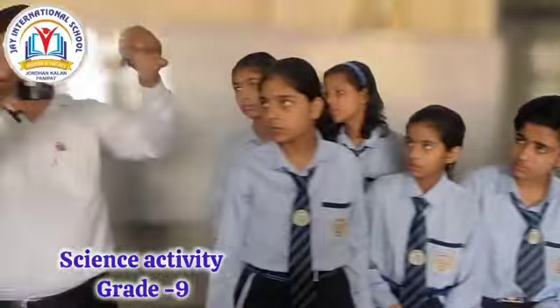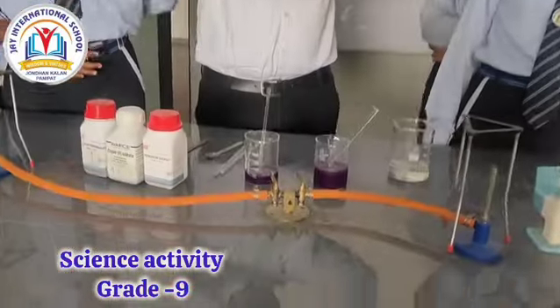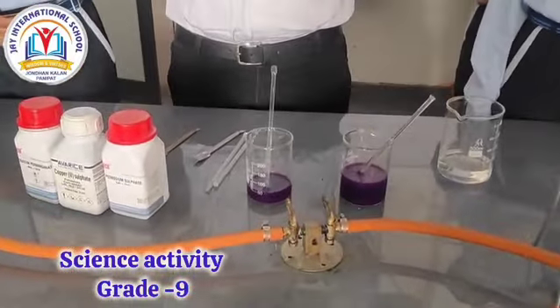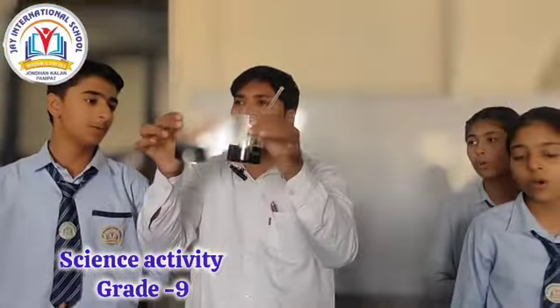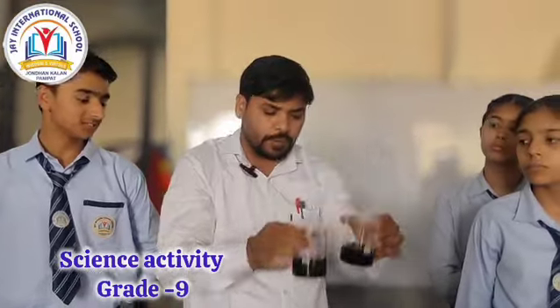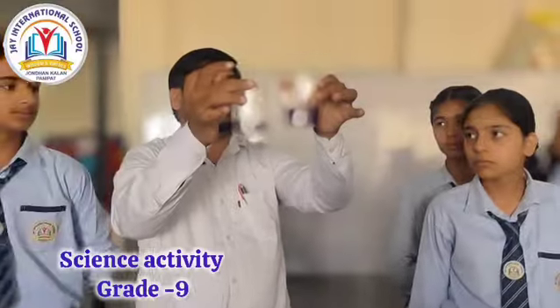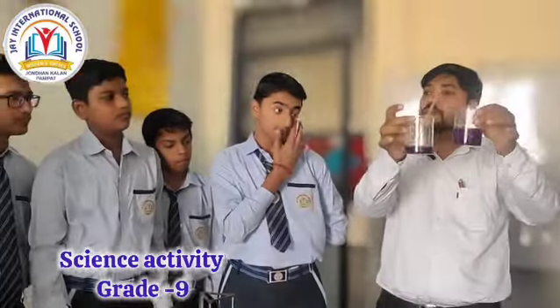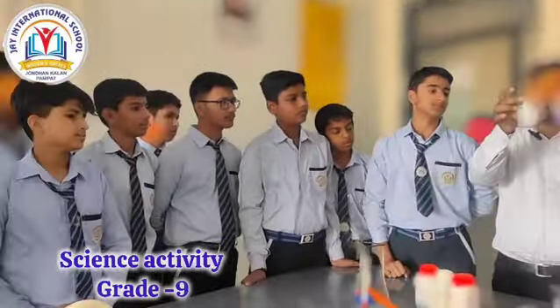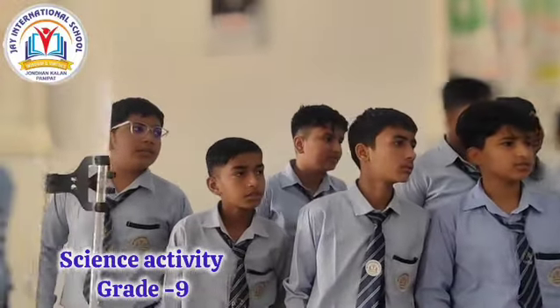So this is beaker first and this is beaker second. What is the color? Purple. So it is your homogeneous mixture, because the composition of particles is uniform. But in this one, because we added 2 types of crystal, copper sulfate and potassium permanganate, this is your heterogeneous mixture.